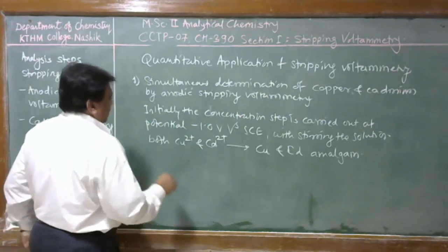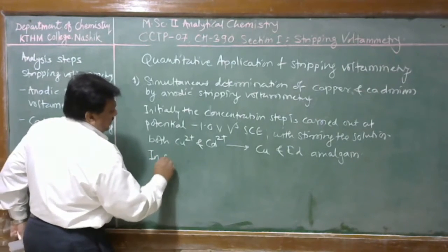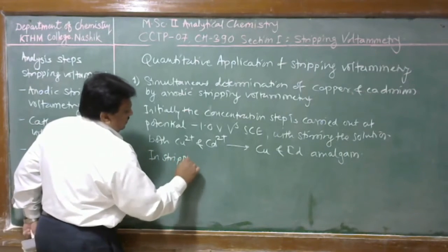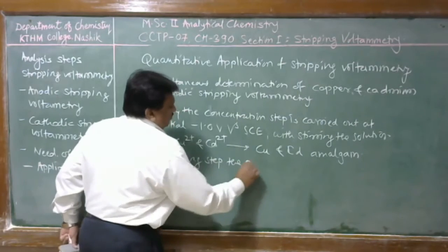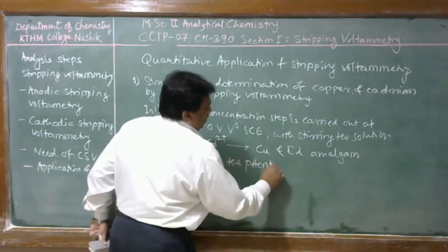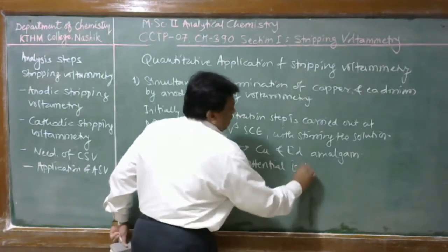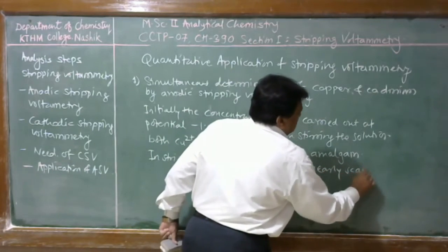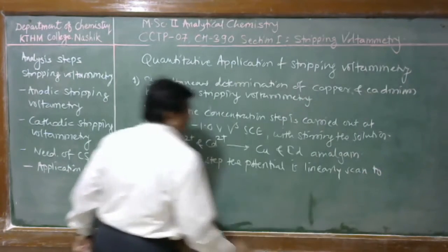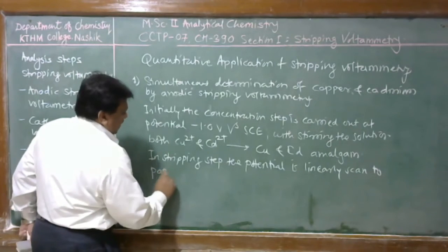Therefore, in the stripping step, the potential is linearly scanned in the positive direction.